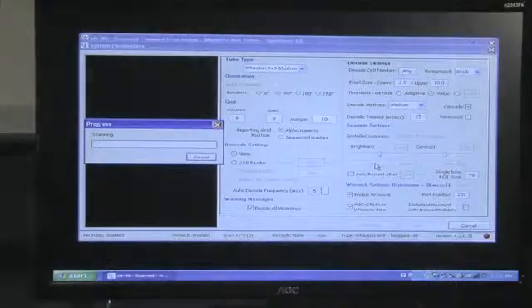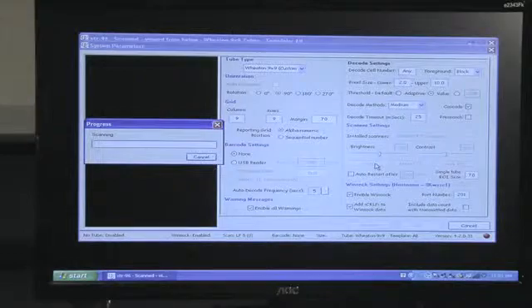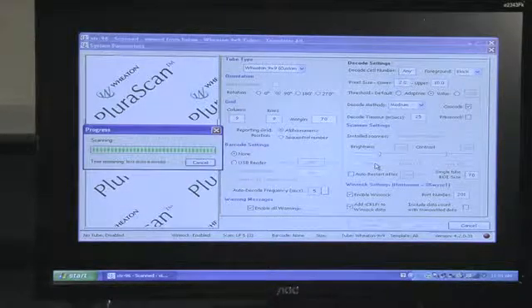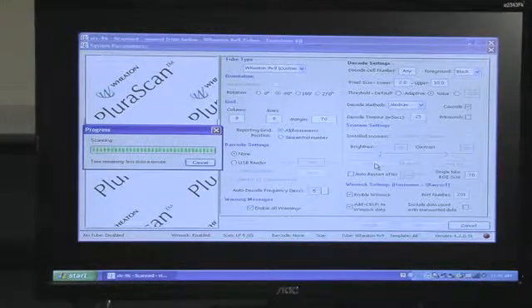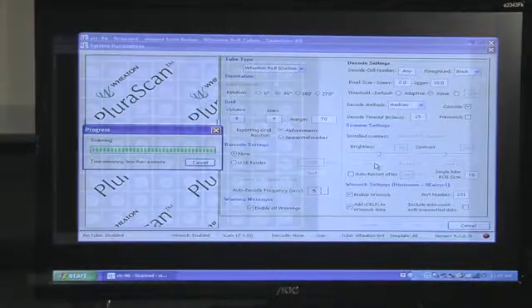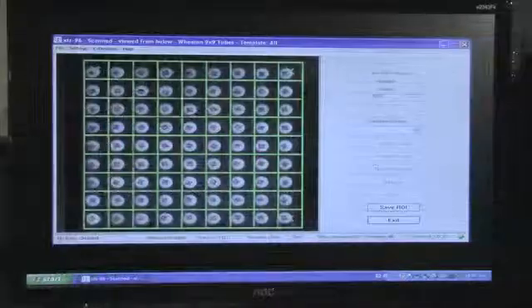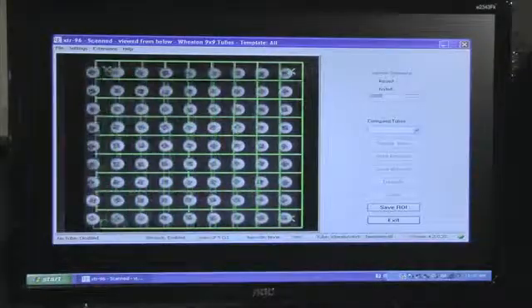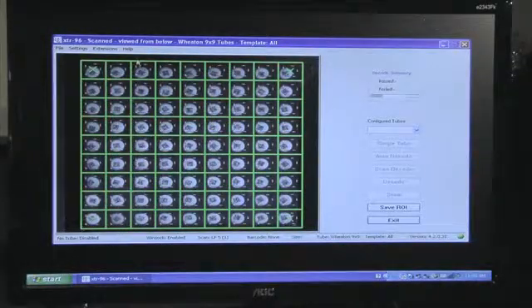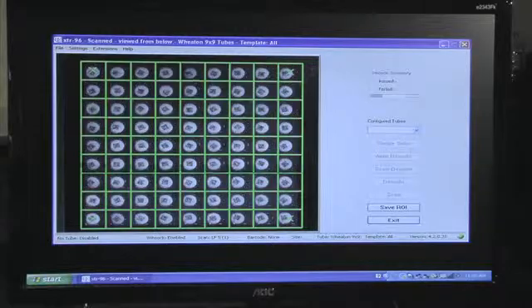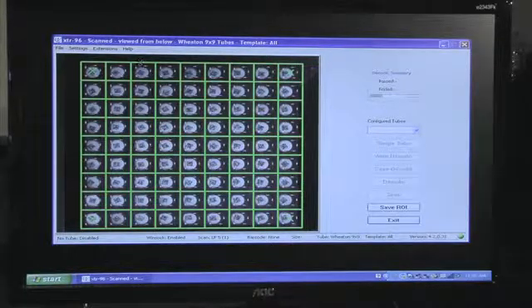The Wheaton PluraScan will now perform a second preliminary scan to designate the grid pattern of the specific rack. Drag the cross lines in the grid to the appropriate locations using your mouse so that a single barcode is present in each square.